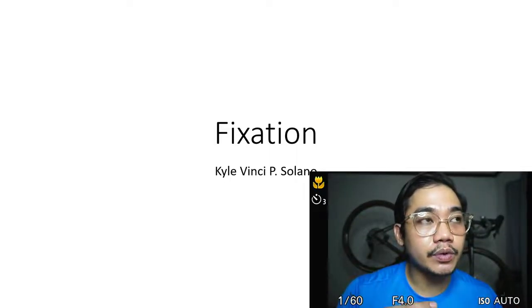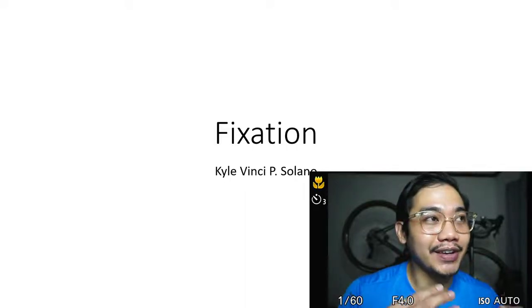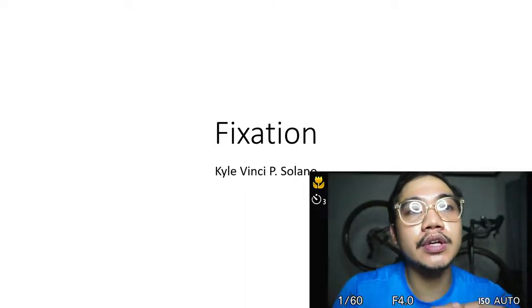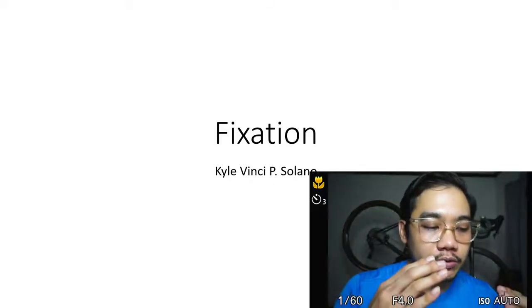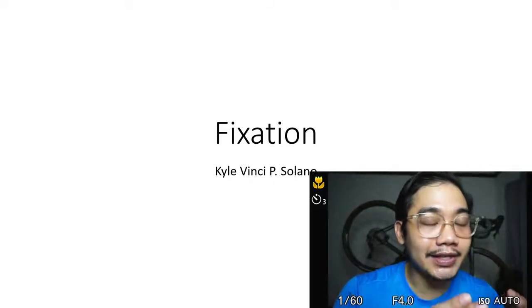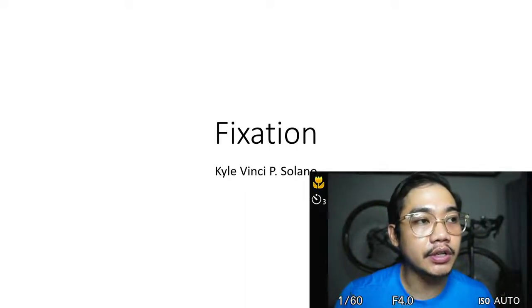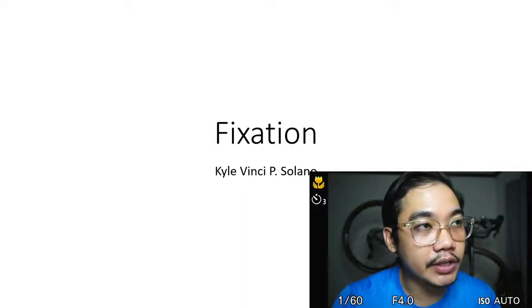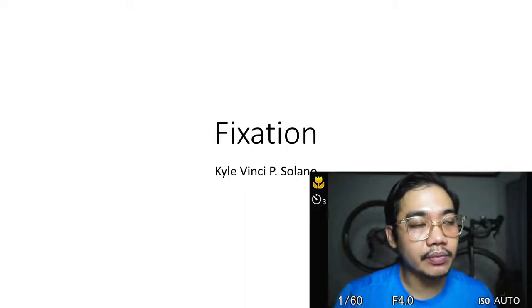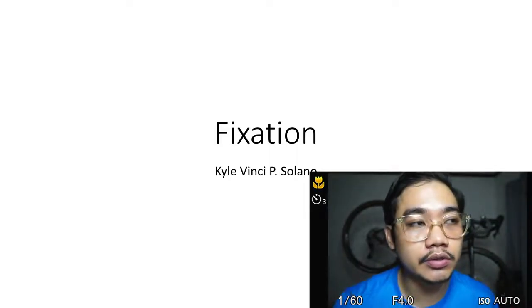And then what will happen, effectively, a fixative kills the tissue, kills the cells, but it fixates it histologically so that we can still see its characteristics, no? So we can still see the columnar cells as columnar cells because they're fixated in that state. And we can still see squamous cells as squamous cells.